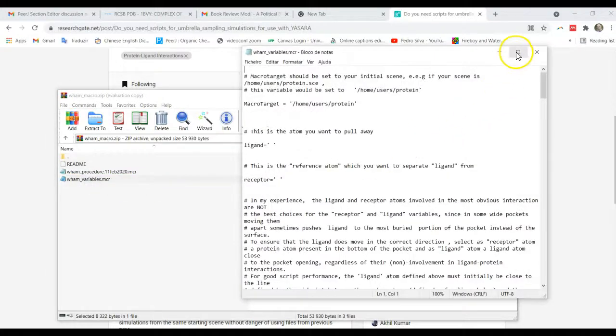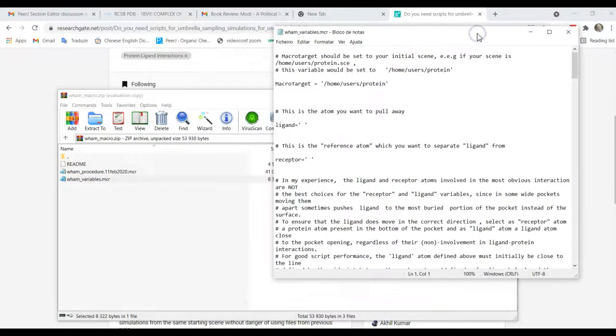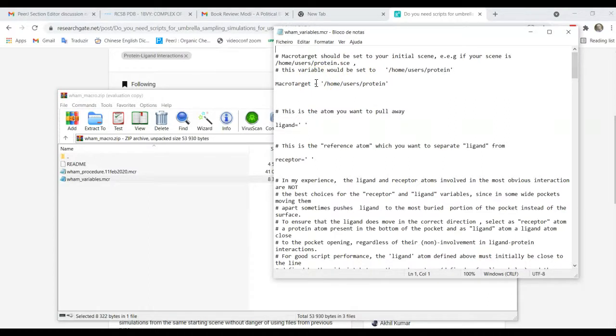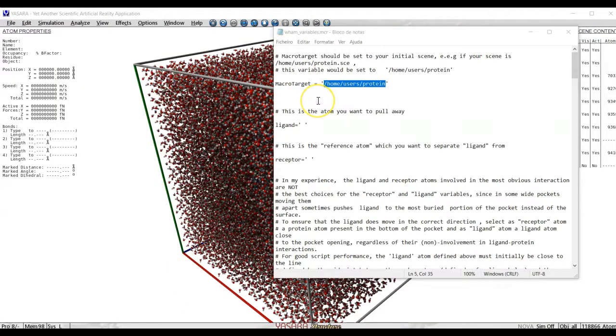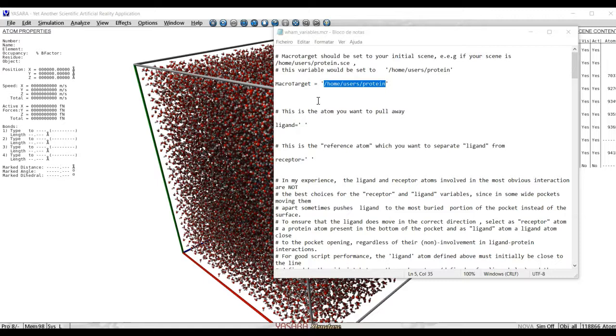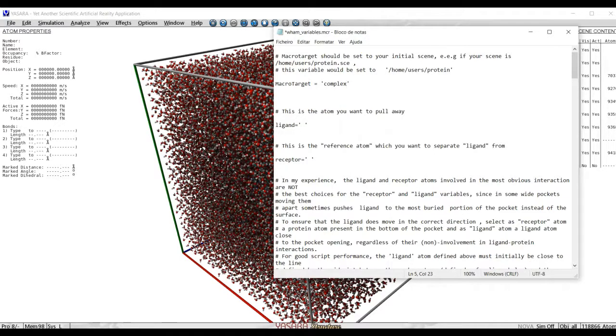There are a few things here that you must change. You start here with macro target. As usual in Yasara macros, you have to select here the address of your scene already including water. For example, if the scene is already in your working directory and if it is called, let's say, complex.sce, we just write it here as complex.